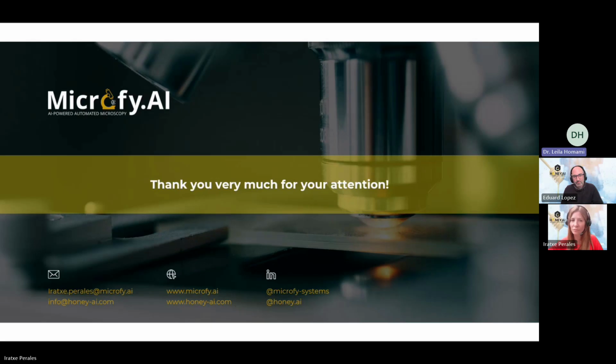My question is, if I choose a region in the AI, for example, or a honey source, for example, I choose sunflower. What if it's chosen mistakenly? For example, I choose sunflower, but it's not a sunflower honey; it's rubus or another source of honey. How will the system react? Does it understand it and, for example, say that it's a mistake and it's not sunflower, or how is it going to be calculated?